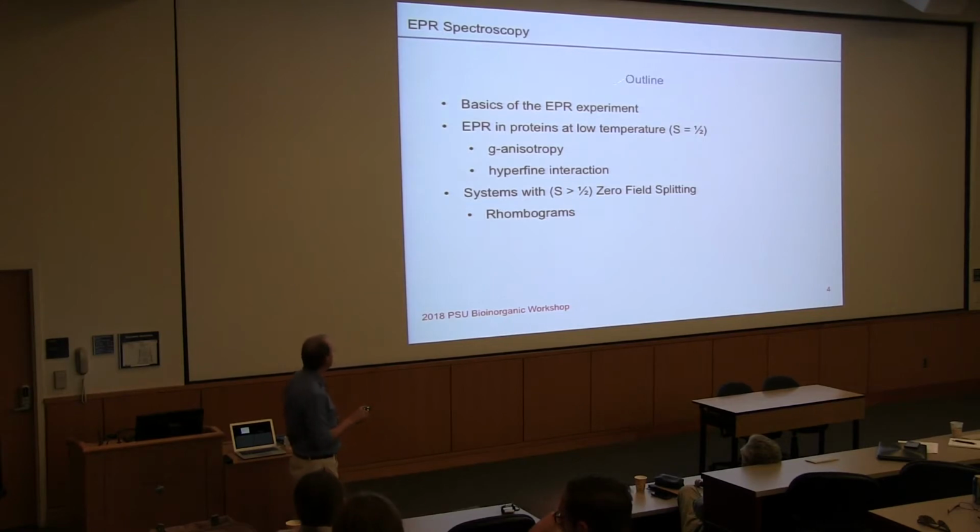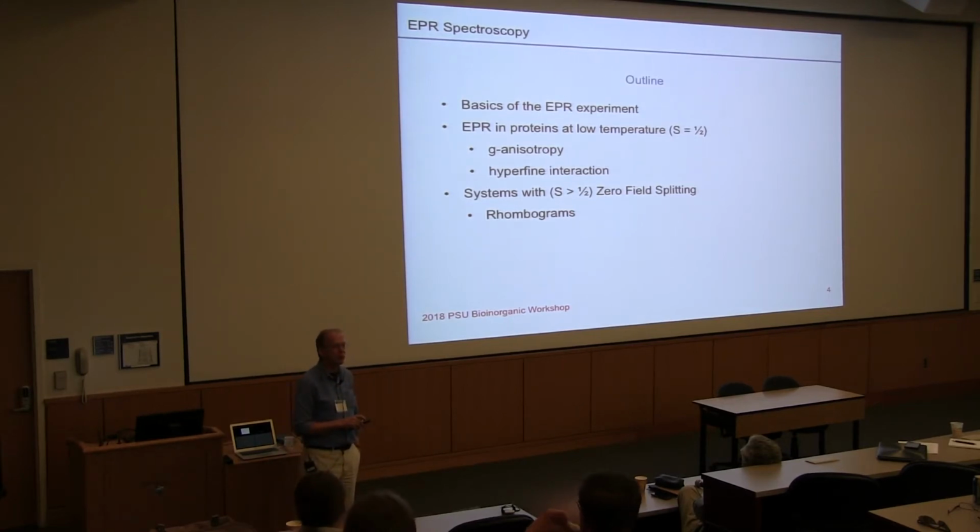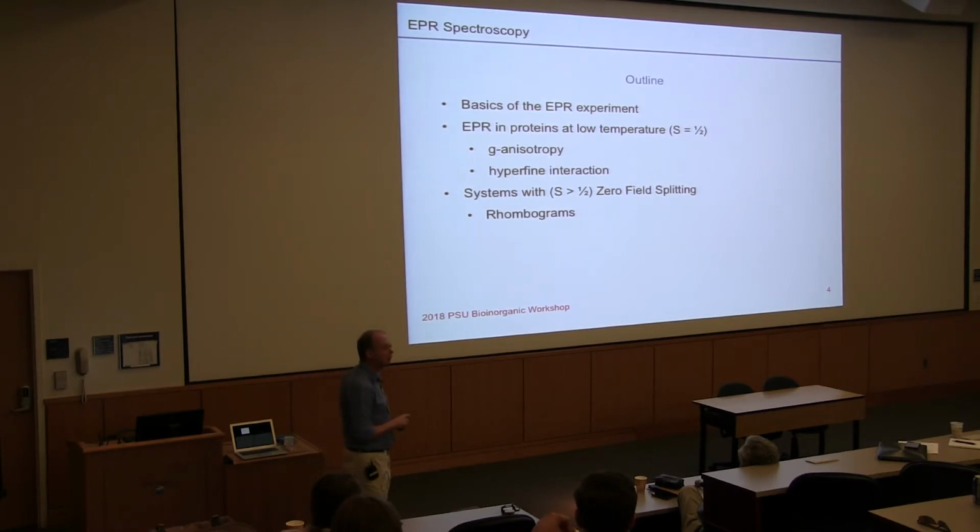The other goal here is also to show you things you have to watch out for if you're running an EPR spectrum. There are parameters that need to be set, and I just want to point out which ones are important and what you have to watch for, because you can often run into problems trying to run an EPR experiment if you're not aware of these things. Then we'll talk a little bit about what sorts of information you can get from an EPR spectrum.